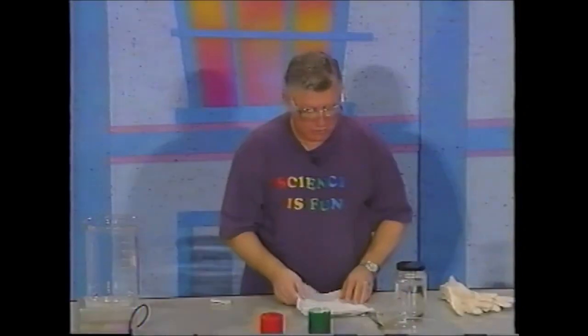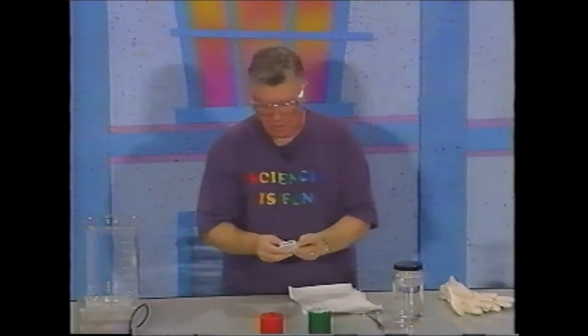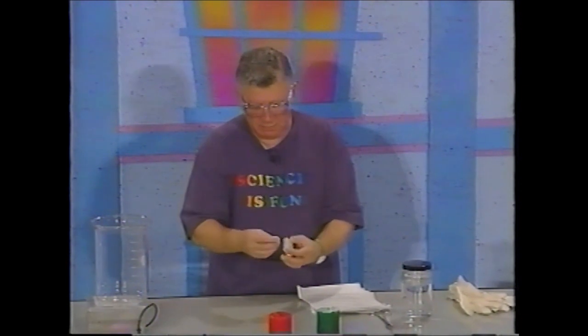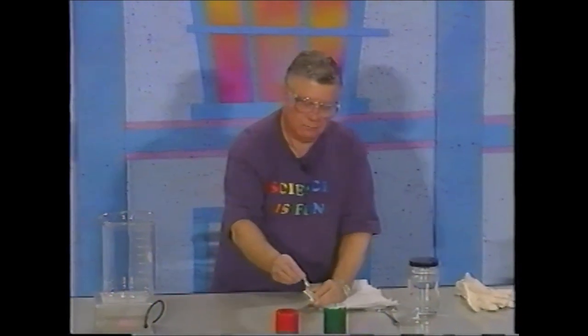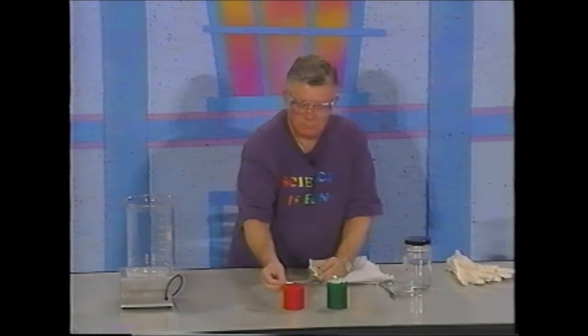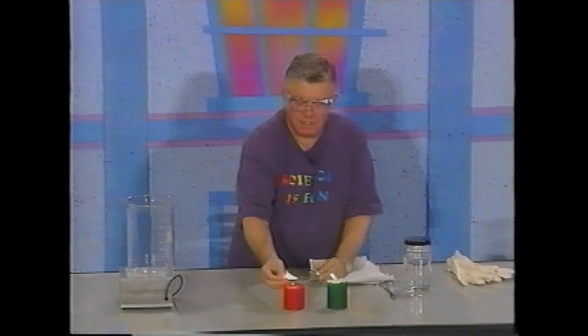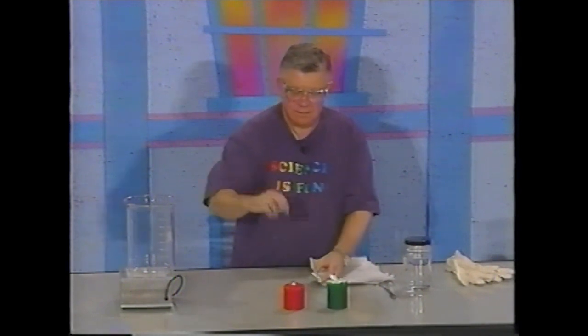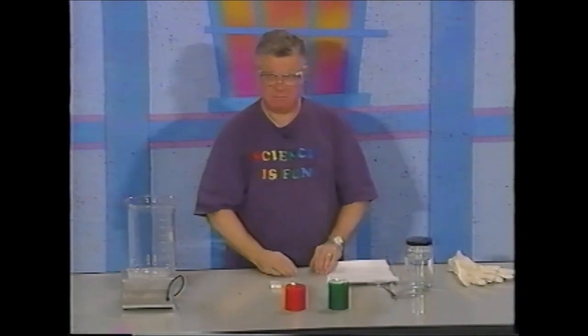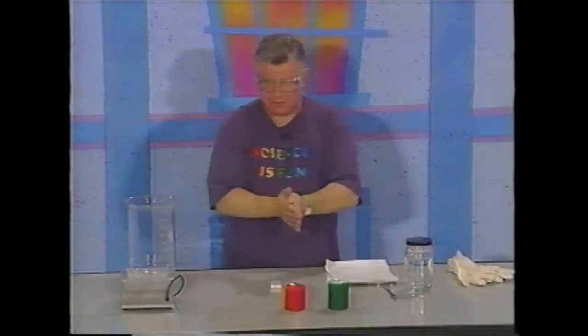The next experiment I'm going to do is one where I'm going to take a match and light a candle. Actually, I'm going to light 2 candles. And some of you are thinking, well, did we come all the way to see Professor Shakhashiri light a candle? This is something that happens all the time. But I want to do some experiments with those candles.